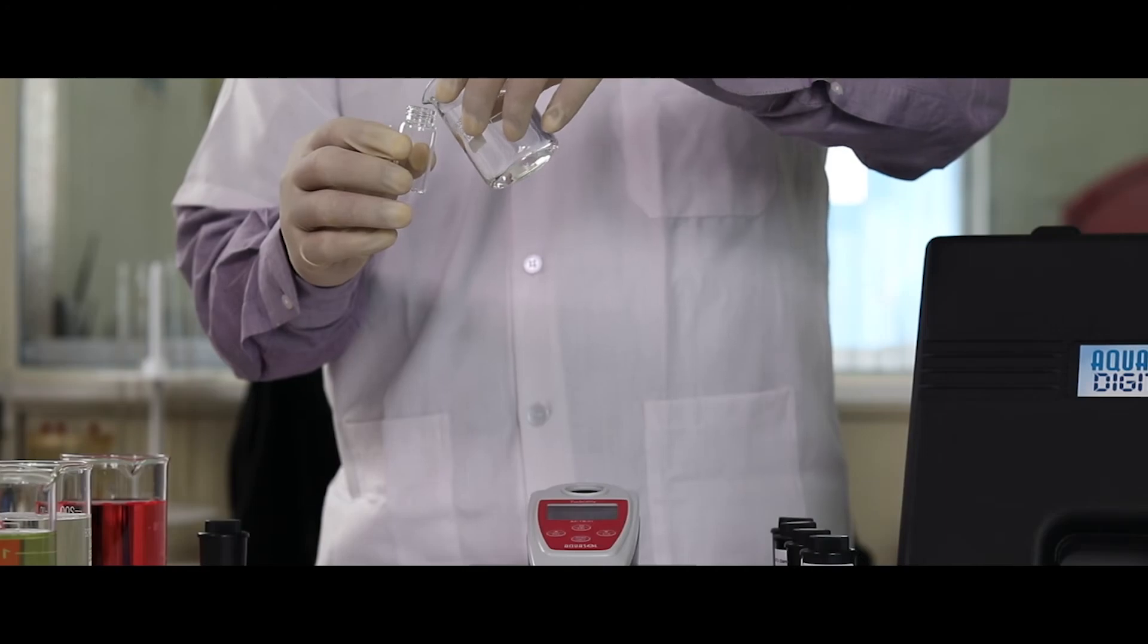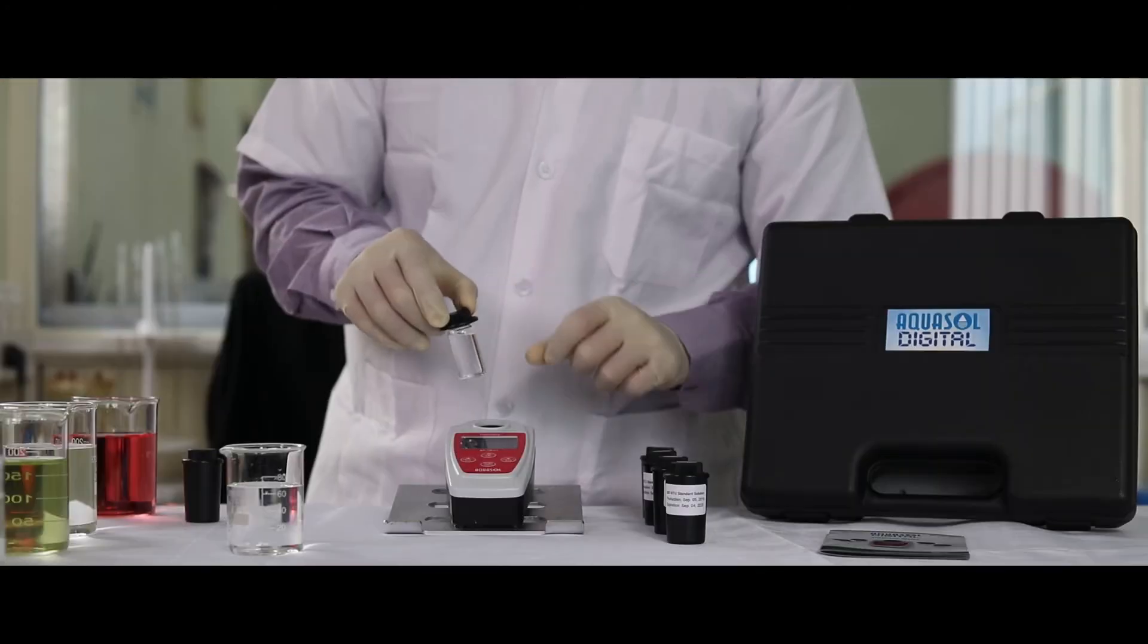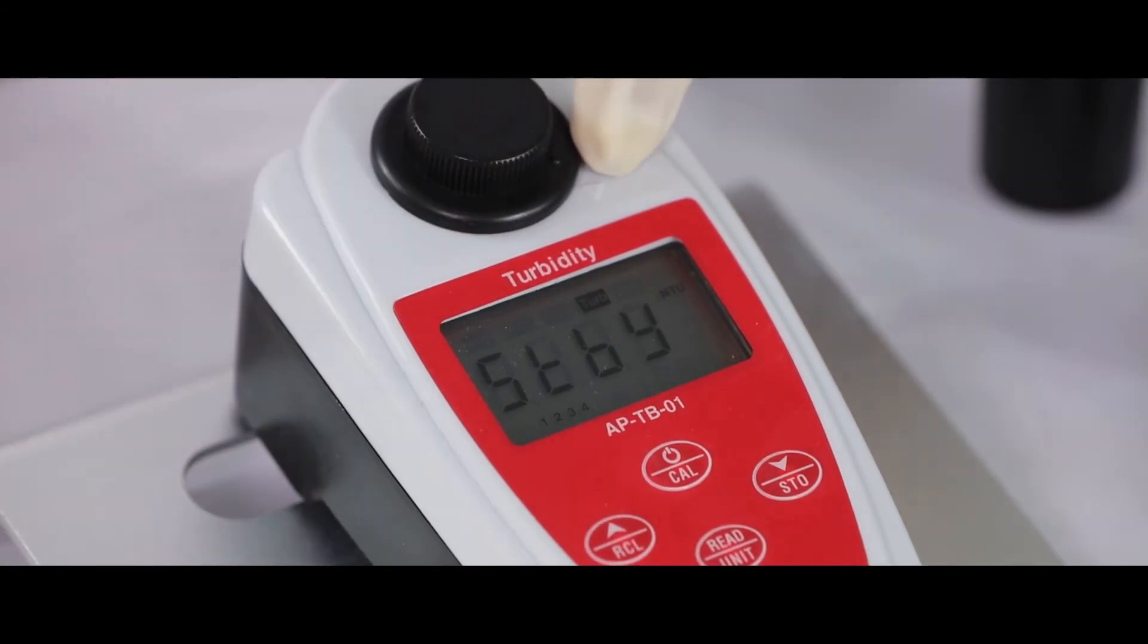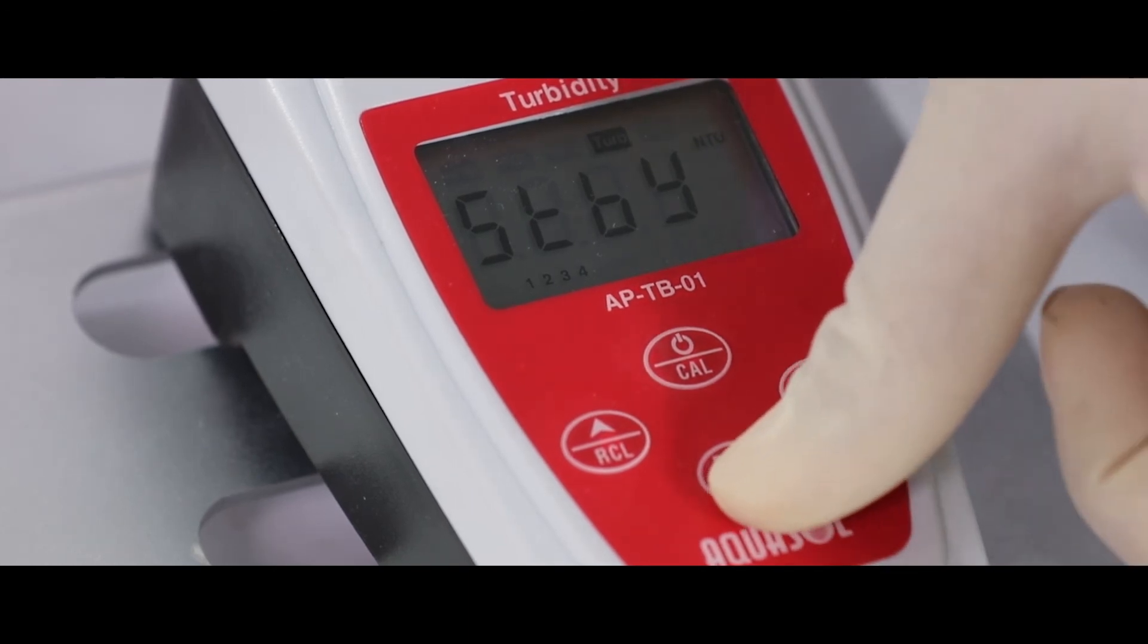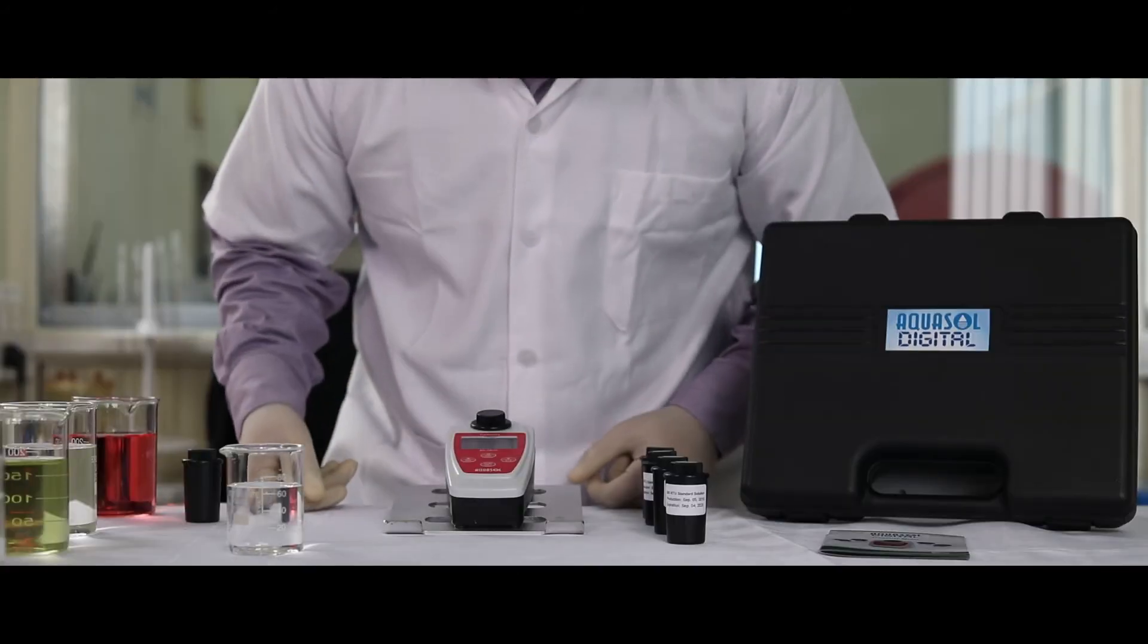To check the reading of a sample, fill the sample into the glass bottle. Place the bottle in the meter, make sure the notch matches, and then press the read key for the value of the solution. To store the reading, press the STO key on the meter.